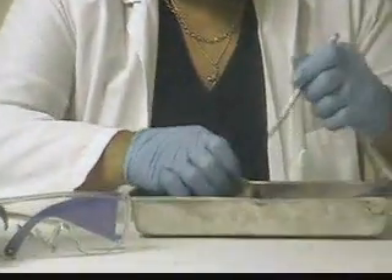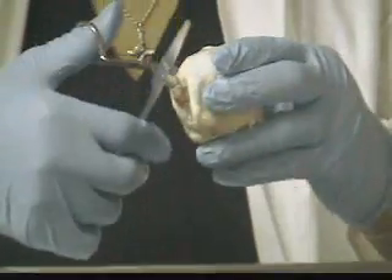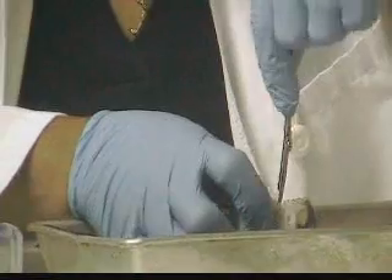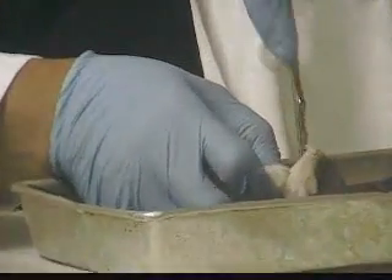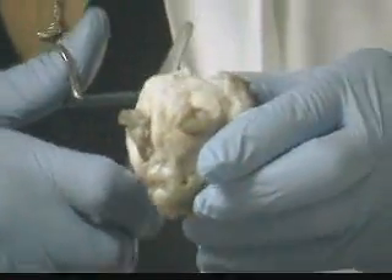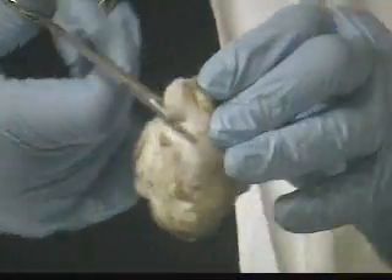I'm going to go ahead and start dissecting. The cow's eye is very tough, so it requires some pressure, and sometimes you have to use more than one tool to penetrate it. Once you're penetrating, you may want to put on some safety goggles, because fluid can squirt out. That fluid is aqueous humor, and you can see it coming out now.